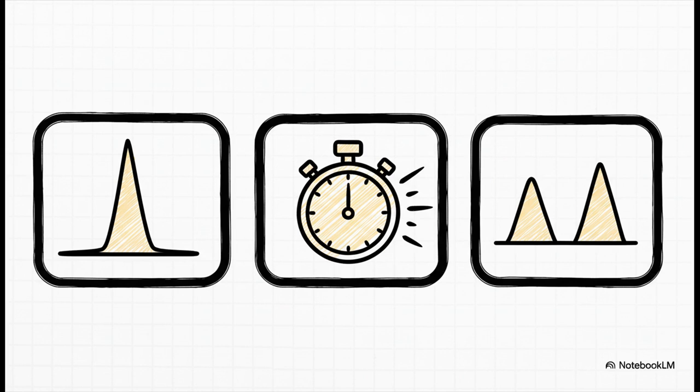Okay, so if you want that perfect separation, we really need to master three key things. First, there's efficiency. That's what gives us those nice sharp peaks. Then you've got speed, because time is always a factor in the lab. And finally, resolution, which is just our ability to clearly tell one compound apart from another. And, lucky for us, there are two key theories that help us understand and, more importantly, control all of this.